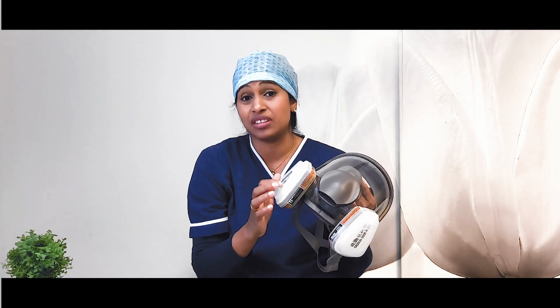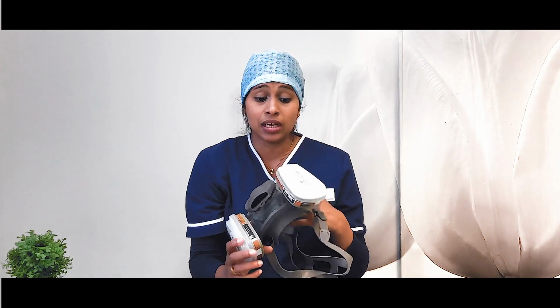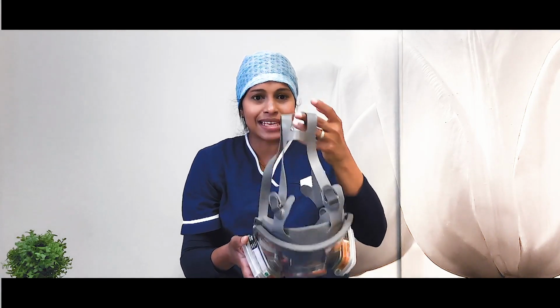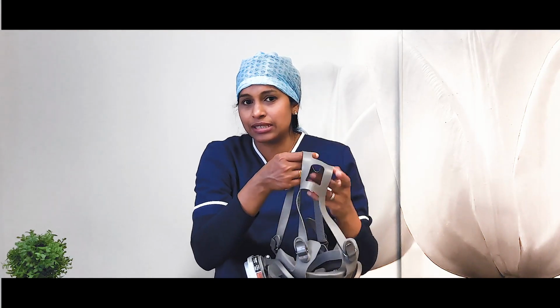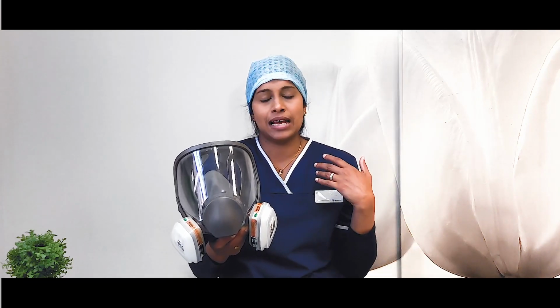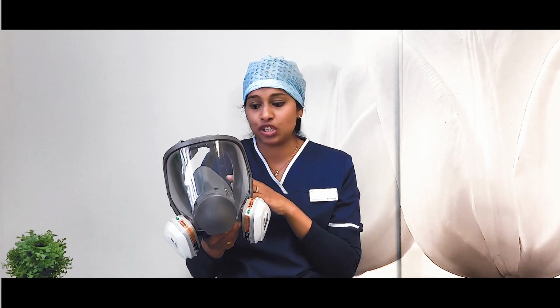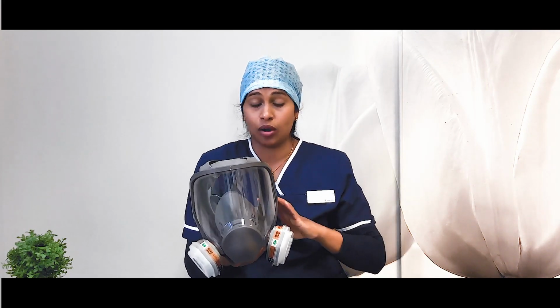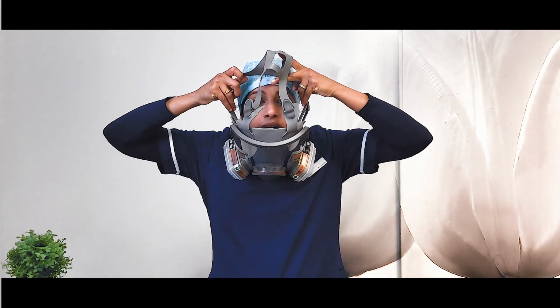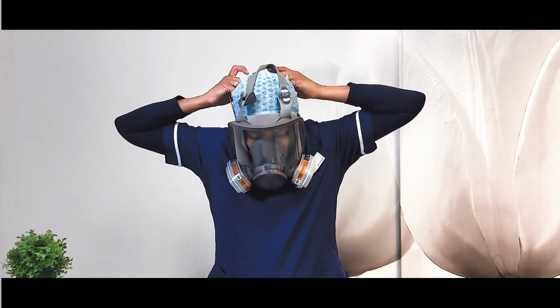The P3 filters are quite difficult to get hold of. Now these full face shield masks have to be quantitatively fit tested, so you have to go to a place where they do the quantitative fit testing. So the normal fit testing is not enough for these, and the advantage is that you don't have to wear the extra face shield, and it protects all of the face. So I'll just try it on for you. You just put it on and then it goes over your head.